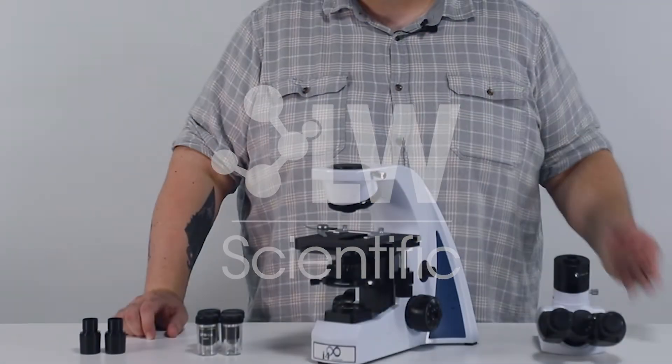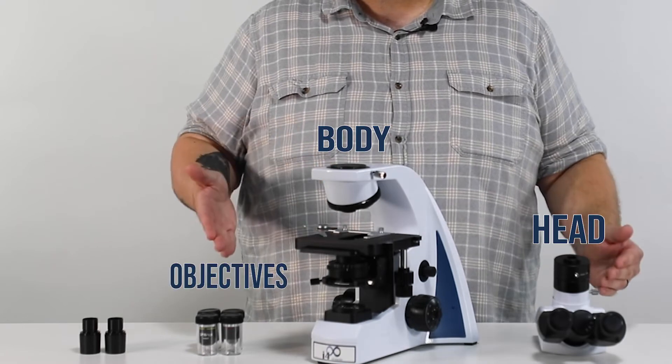There are four main parts to assemble on your microscope: the head, the body, the objectives, and the eyepieces.